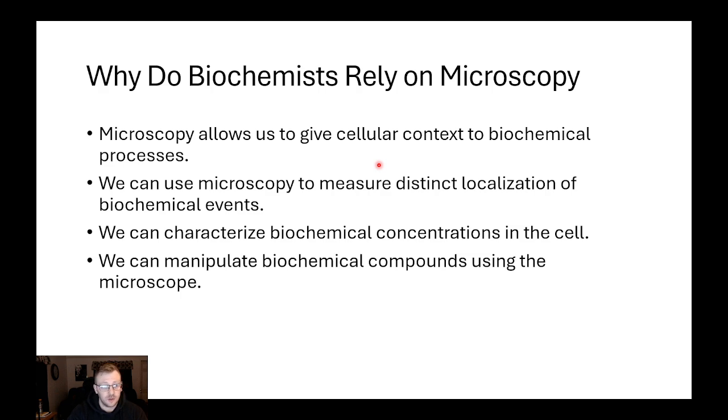So we're going to get into a little bit later photoclick chemistry and photomanipulation of molecules using photon excitations, which is super cool stuff that we're going to get into, and it's becoming a very powerful technique in the field of microscopy and in the field of biology in general.